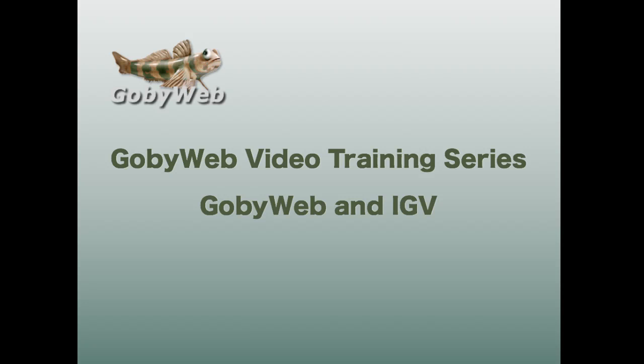Welcome to the GobyWeb video training series. In this tutorial, we will look at how to visualize output files from GobyWeb using the Integrative Genomics Viewer, IGV. Firstly, we will look at visualizing alignments in the Goby format in IGV, and then we will look at visualizing VCF files outputted by GobyWeb.